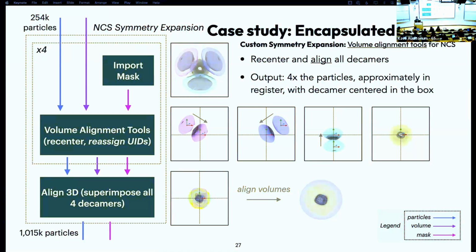This reminds me a lot of the symmetry mismatch at the portal complex of a virus, where you have a five-fold vertex and the six-fold or 12-fold or 18-fold of the portal complex. Right. In that case, there's a little bit of difference because the five-fold and the six-fold axes are coincident, so it's a little easier to figure this out. Yeah. And what usually happens is that you look at the actual touching of the five-fold densities and the six-fold densities, and you see that, yeah, they are slightly different because they're interacting with something a little bit different around each of them.